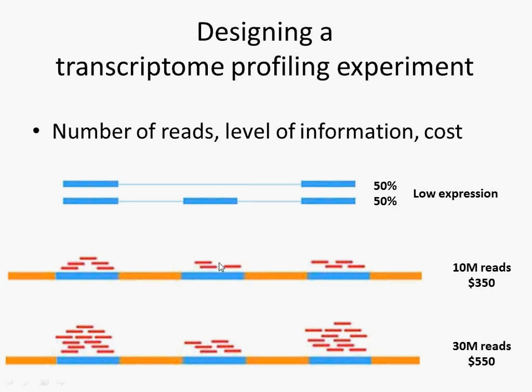you will see that you could have a slight difficulty with the low expressor in terms of quantifying the 3 different exons individually, which are present in this sample.